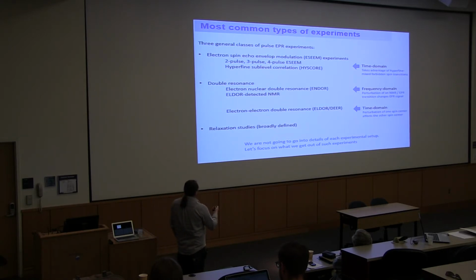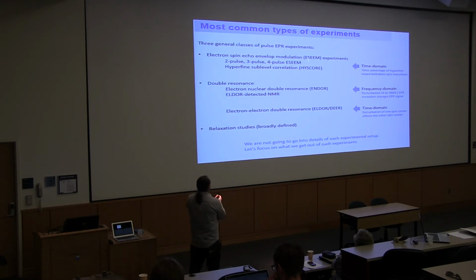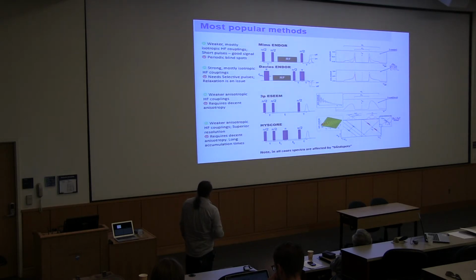So there are all these kind of techniques. Let's just focus on something that gives us this NMR spectrum: ESEEM, HYSCORE, or ENDOR, and we forget about DEER and relaxation studies for now.